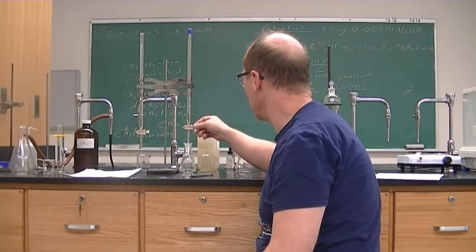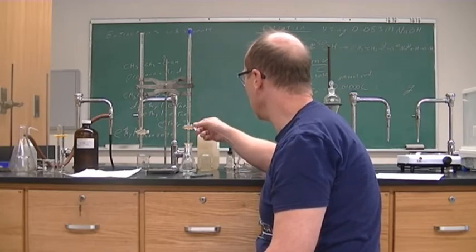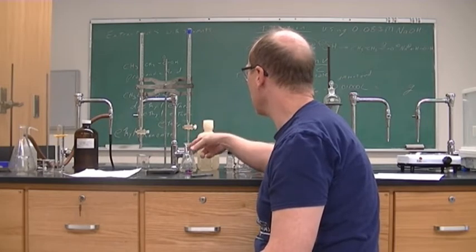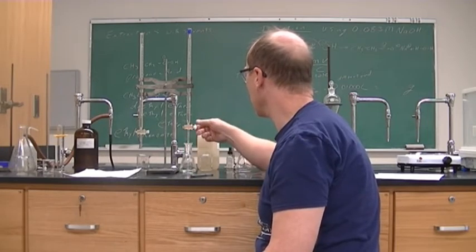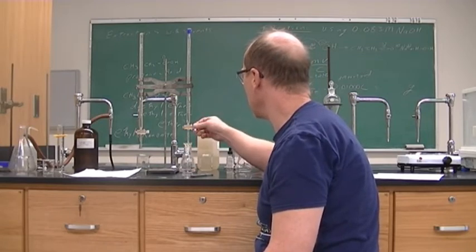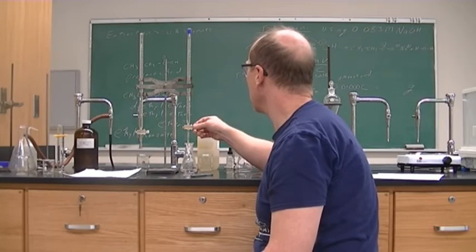Very close. I can add it a drop at a time, but again, it's got to stay for 30 seconds while swirling. Add another drop. Alright, let's see. That's not going to stay.